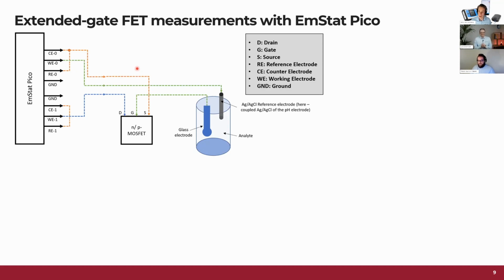Yep, great. Marcin, can you also measure polymeric electrical characteristics like conductivity, permittivity, and others? Well, depending on what you mean by polymeric materials, because for example, in organic electrochemical transistors, where we use, for example, PEDOT:PSS, that's definitely possible to be measured, because we're still in this plus minus 1 volt range, and the plus minus say nano to micro amp value. So this is definitely possible to measure OECTs based on polymers here. I don't know if this answered the question, but I hope so. We'll see in the responses.